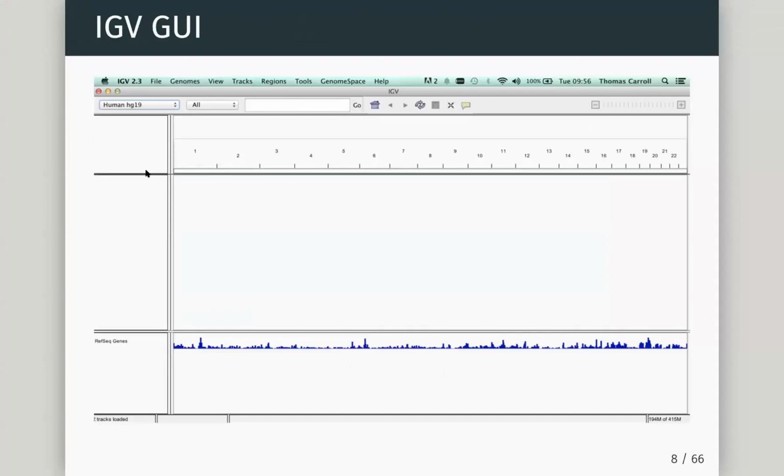Okay, so this is tricky for me because I'm on a laptop and I've got my slides and my IGV behind here. So I'm going to talk through some slides, just to make sure I'm still recording. Am I definitely recording? I'm going to talk through some slides and then I'm going to hop into the GUI just to show you it actually in action. So this is what IGV looks like when you load it.